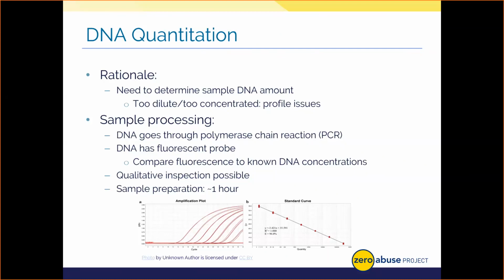The DNA gets a light emitting or fluorescent tag on it. When new DNA is made, that light molecule is knocked off the DNA and it shines such that our instrument can detect it. You see the amplification plot at your bottom left. The more DNA we make, the greater the fluorescence that we see with each reaction cycle. Now, some quantitation chemistries also include a target, which is really nice, that allows you to measure if your DNA is degraded or contaminated. Now, it takes overall about an hour to an hour and a half to go from prepping the kit to processing these samples and getting results.